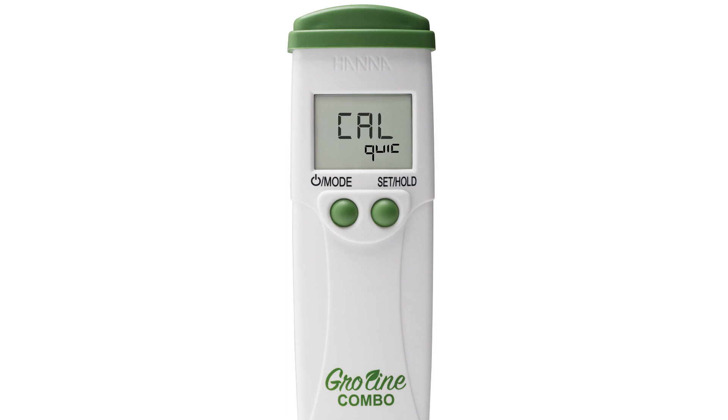Once you have your calibration type, press the mode button again to choose your temperature settings. By pressing the set hold button you will see the temperature units change from Celsius to Fahrenheit. Press mode again and you can now choose your auto-off setting. Pressing the set hold button will let you choose between 8 minutes, 60 minutes, or you can turn the setting off completely.